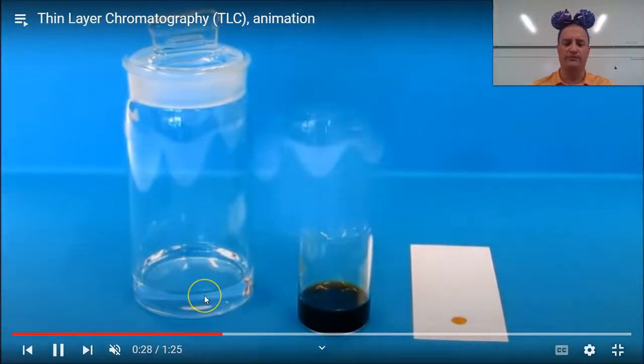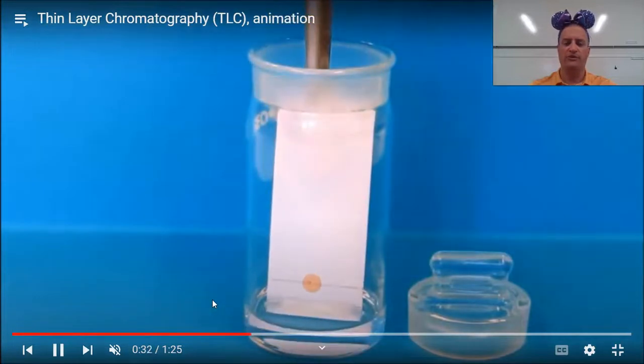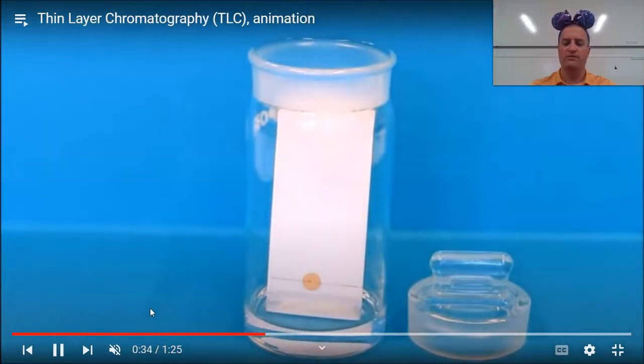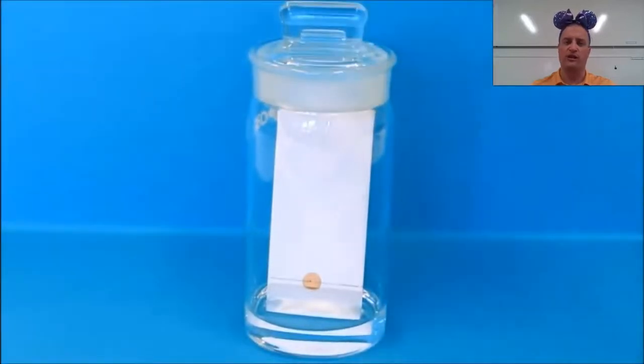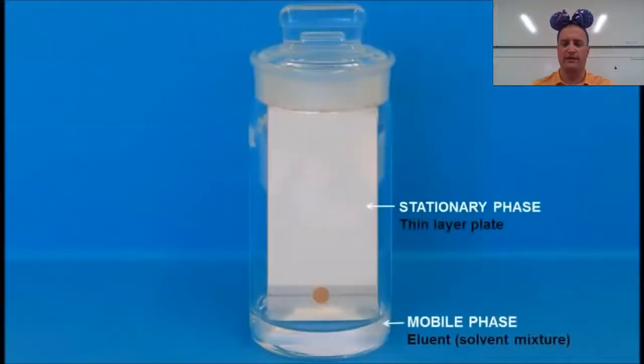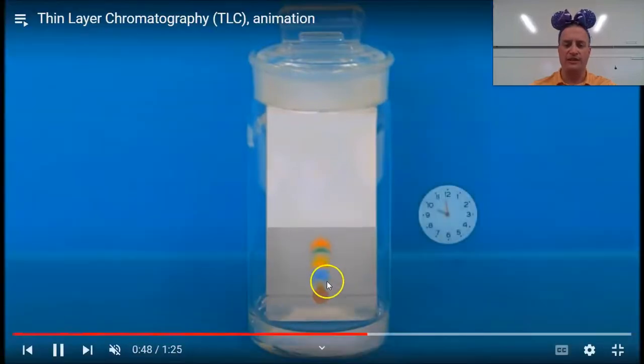However, if we're able to take this out, thinking of our stationary phase being our paper and our mobile phase being the solvent, it'll be able to push out those different components. However, we can't utilize these different components. This is more for a qualitative measurement. So you have our thin layer plate being the stationary, mobile phase being that. It goes up through capillary action, and you can see the separation over time of the different components, and that's based upon its polarity with the mobile phase.